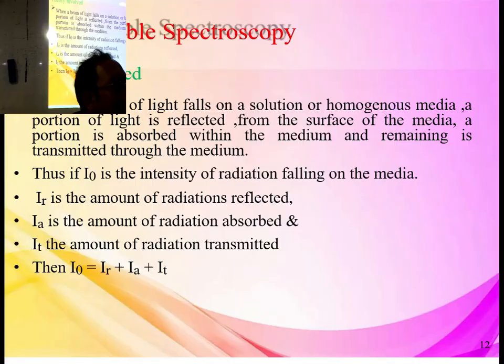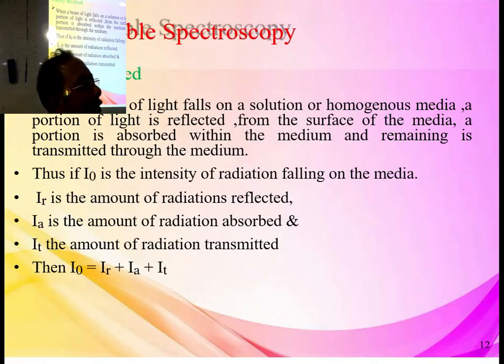What is the principle? Very simple. If you have a higher concentration of the solution, there will be more absorption. If you have a longer thickness of the cuvette, that means a longer path length of the cuvette, then also your absorption will be more. Other conditions fixed. Only these parameters you are changing. If you change all parameters together, you cannot understand anything. You have to always change one parameter to understand the effect.